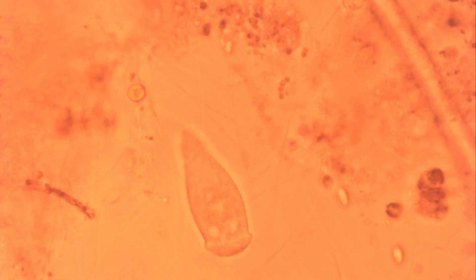Oh look, a rotifer! The camera might just be able to make out their tiny moving mouth parts, but not very well. I can see them through the eyepiece but the camera isn't all that good.